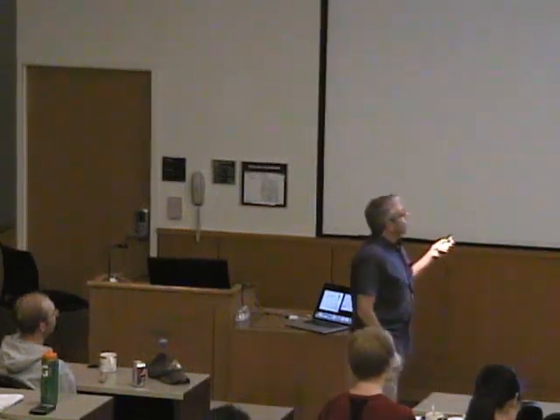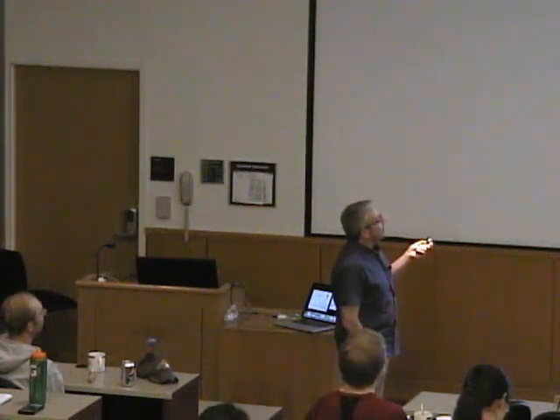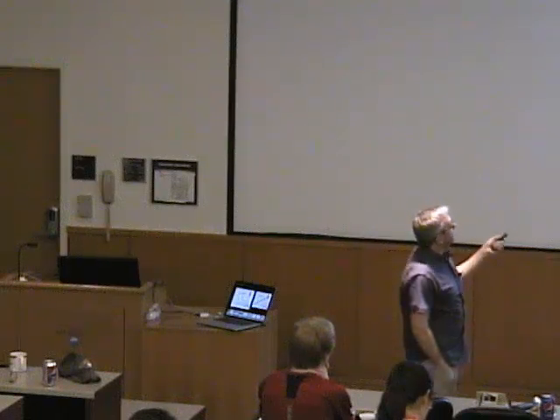But if you get to a certain critical point where you have generated aggregates that have a critical size, then it will be energetically favorable to add more to them, because the energy gain, or the entropy gain of the system, by shedding your hydration shell, if you can form contacts on like three sides or so, is so much higher that at some point it goes by itself.